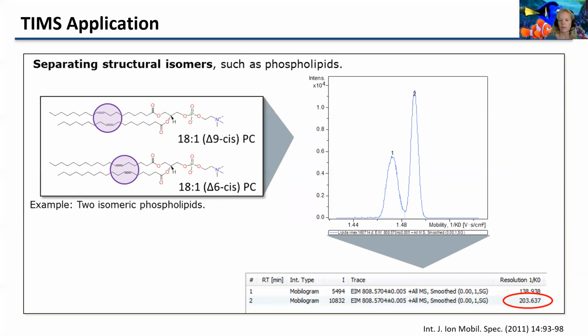And I've heard that a majority of the time this takes close to a second. If they need to connect this to faster techniques like LC, though, they have to go down on their resolving power because they need higher throughput for their system. So then their system is operating more at like the 60 to 80 resolving power if you're doing LC timescales.